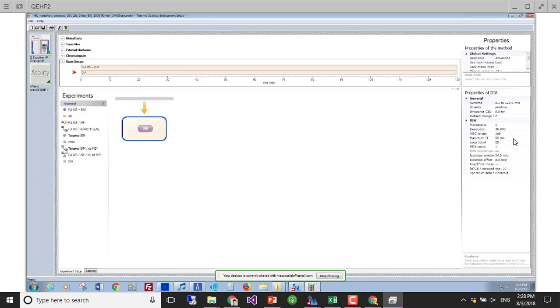Here, we want a fast MS1 because, honestly, it's for helping us understand what's going on with the data more than for the algorithms to use. And we want good MS2s because we want good quantitative measurements from those scans. So that's basically the normal parameters that you would use.